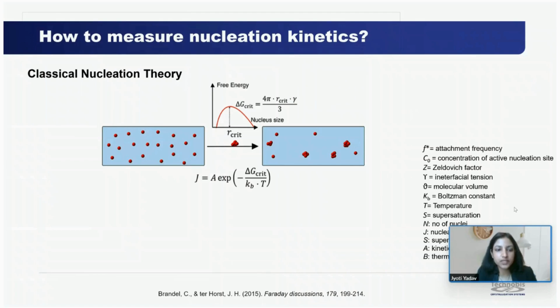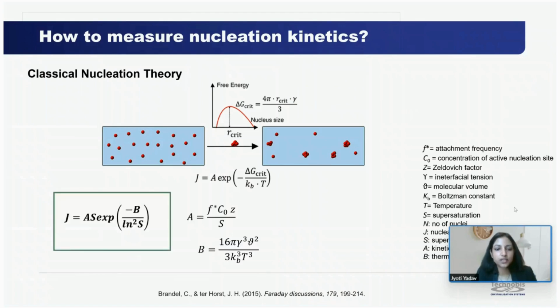Next. Then according to classical nucleation theory, the nucleation rate J depends upon the supersaturation ratio S following the given equation, where A is the kinetic parameter and B is the thermodynamic parameter. So one of the methods to determine the nucleation kinetics experimentally is by measuring the induction time.